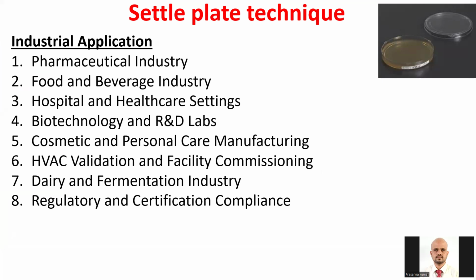This is very important because once you start your pure culturing and characterization, you need to know who is living around you, how fast it is floating, and how fast it is settling down. That's why this is called the settle plate technique. It is very important because it is used in various industries.